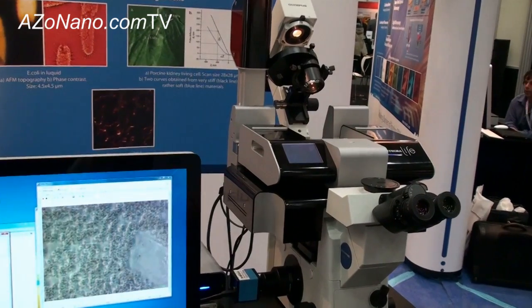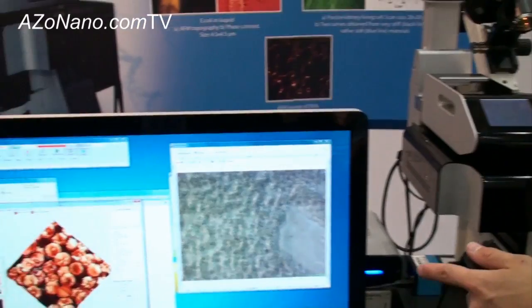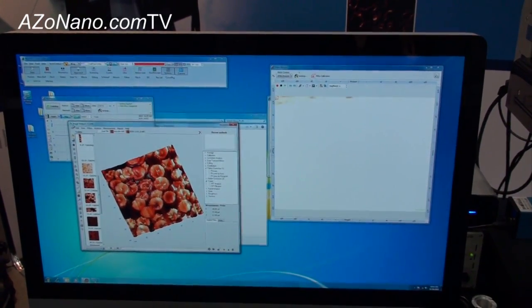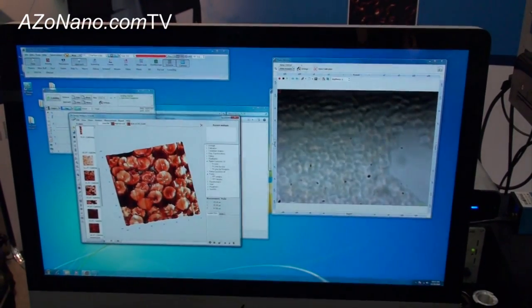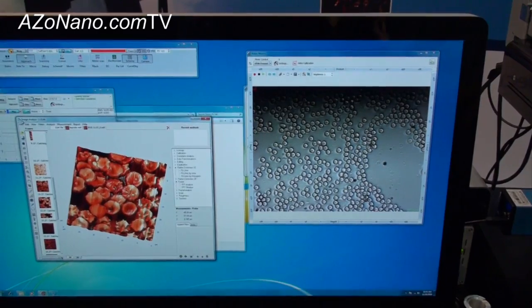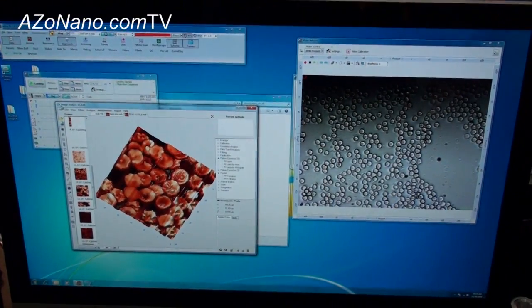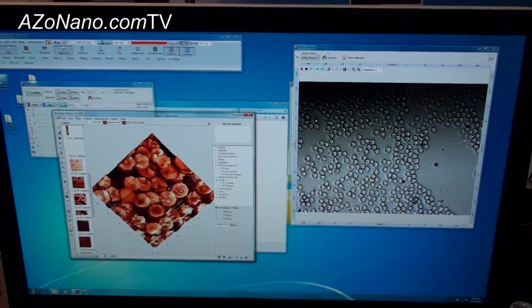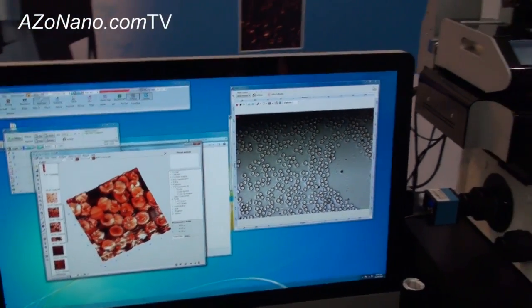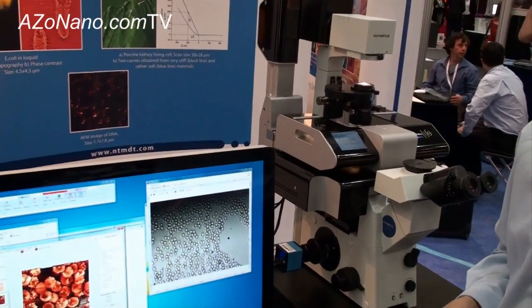Here you can see an example of how the head can be lifted. On the screen, we see erythrocytes — the optical image of erythrocytes — and here you see the AFM image of the same erythrocytes. These can be acquired simultaneously, so during a single experiment.